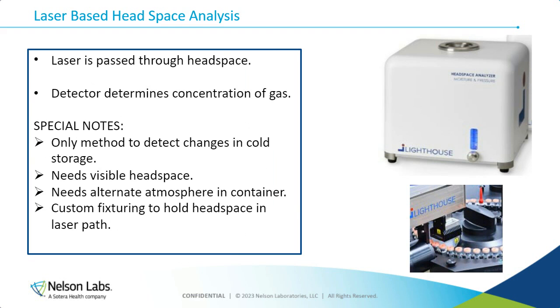The next one in that detector emitter section is going to be laser-based headspace. In this one, I'm sending a laser through. That laser is going to be tuned to a certain gas. Most of them are going to be oxygen, but you could get one that was nitrogen or carbon dioxide.